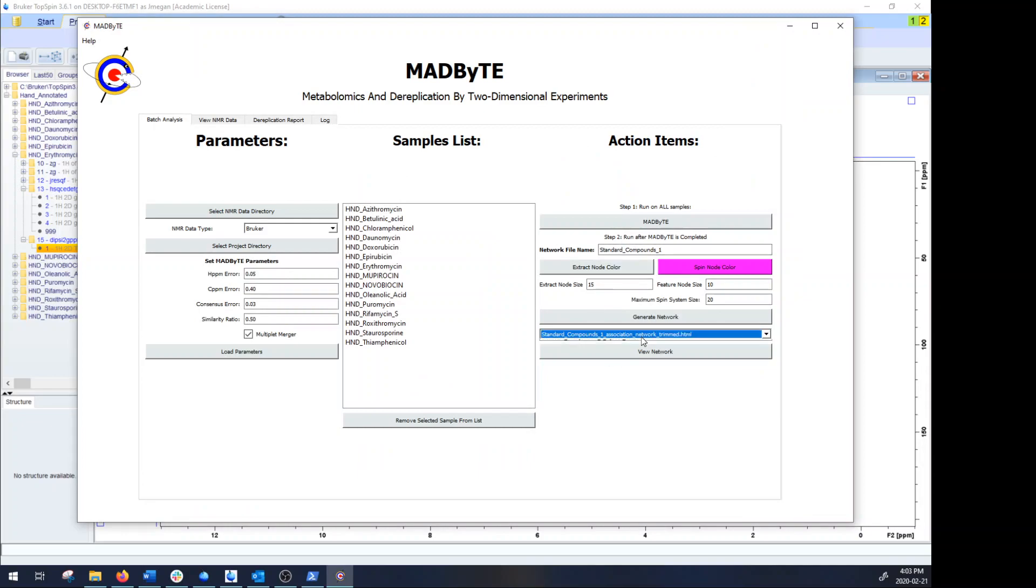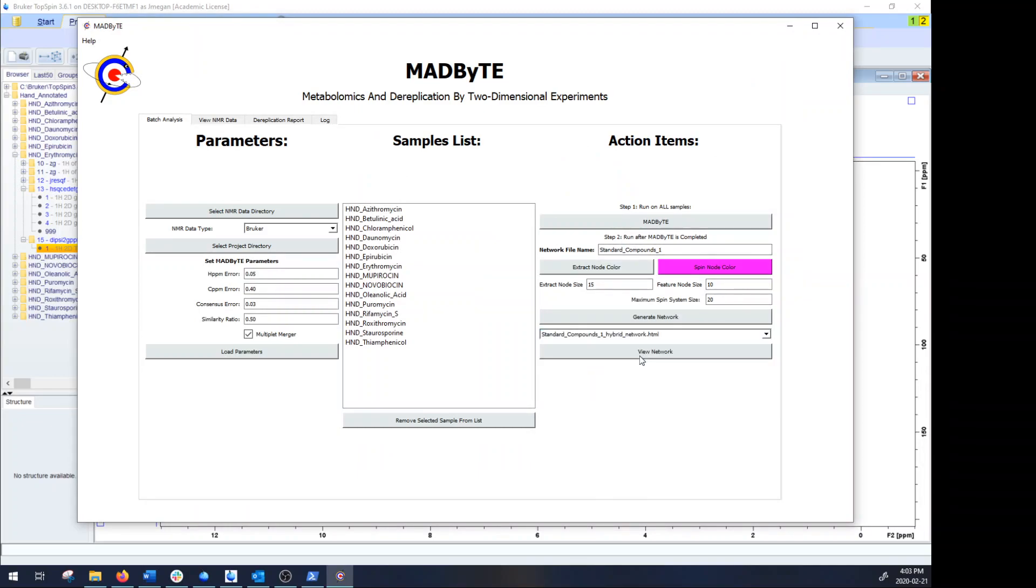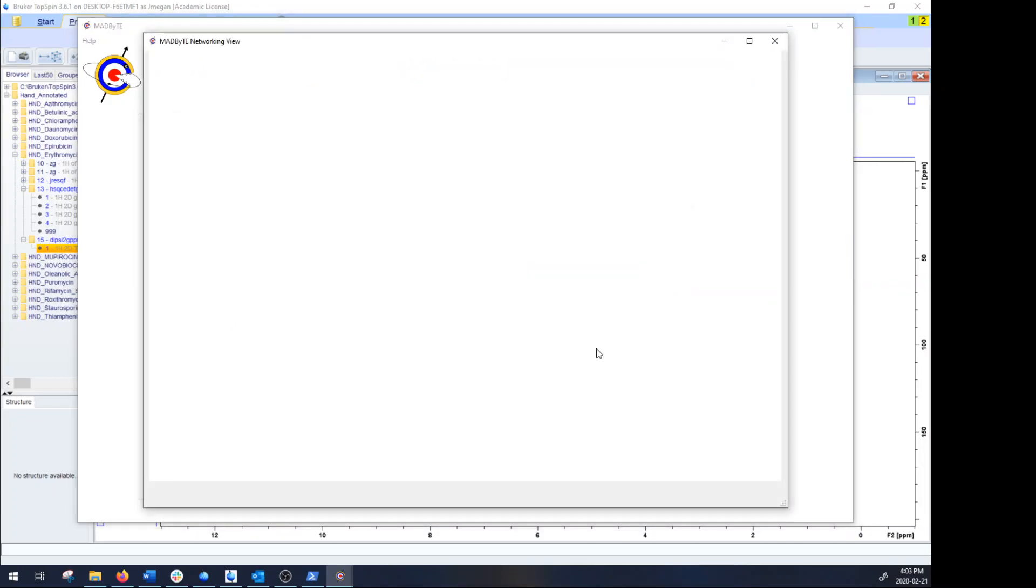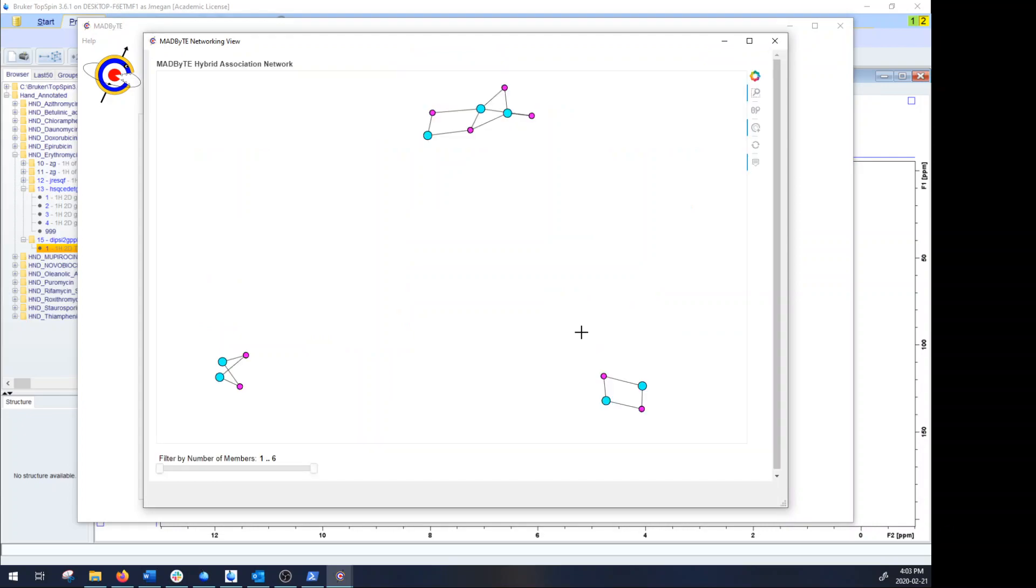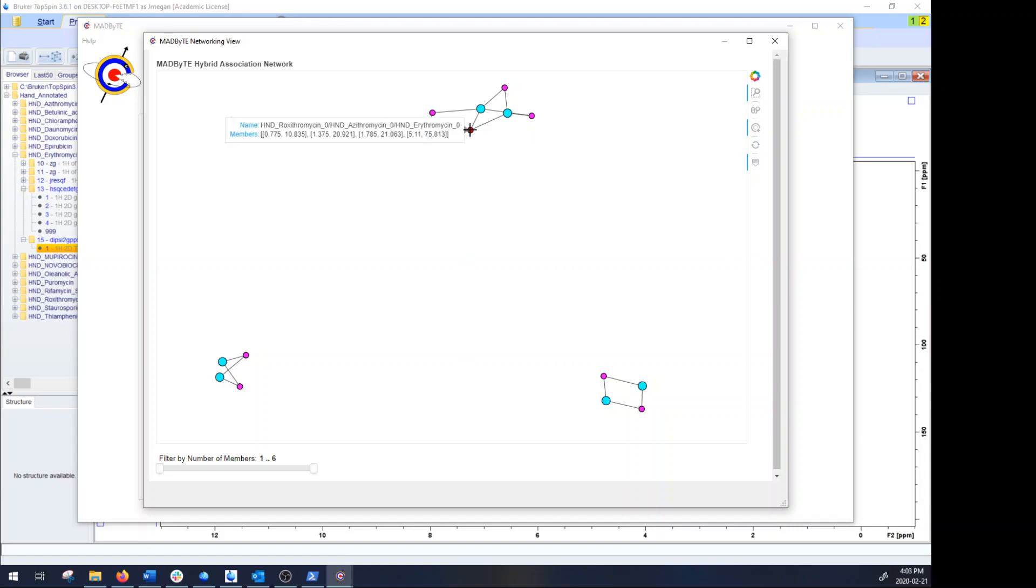The last type is the hybrid association network. In the hybrid association network we've taken those shared chemical associations and we've actually collapsed them down to singular points. So for instance that triangle motif we saw in the last one is now collapsed into a spin system of four members that are all of the features that it saw between all of the samples that share those nodes.